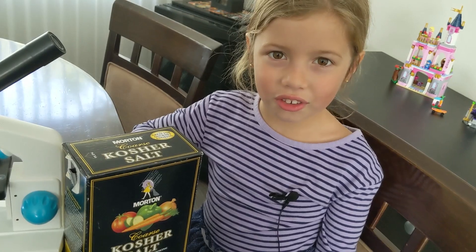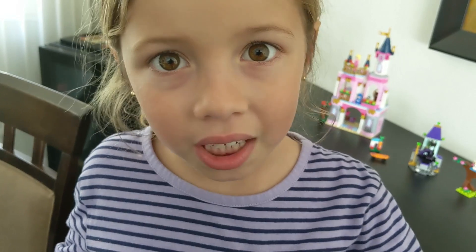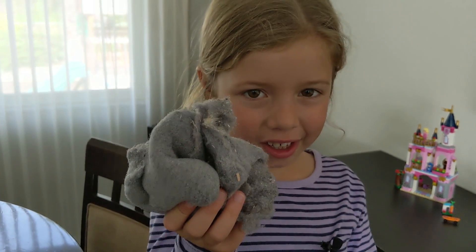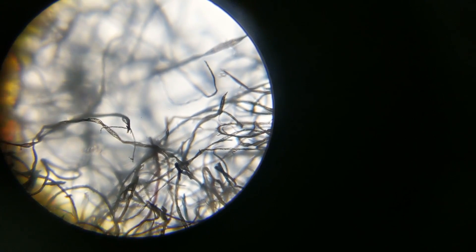Now we'll look at some salt. It looks kind of like a cloud made of ice. I wish I had regular table salt — that would look cooler. Now let's look at the dryer lint. It looks like tangled bug hair.